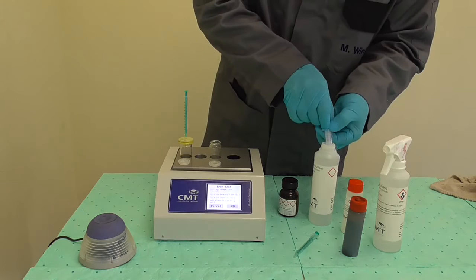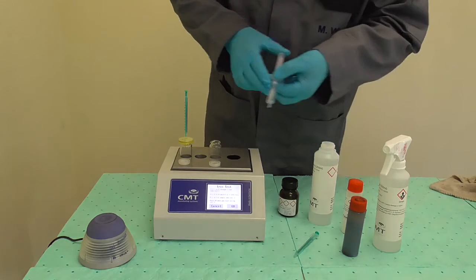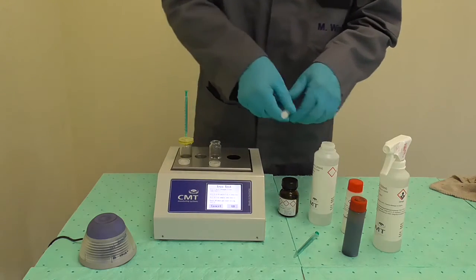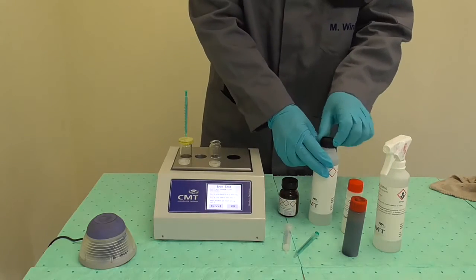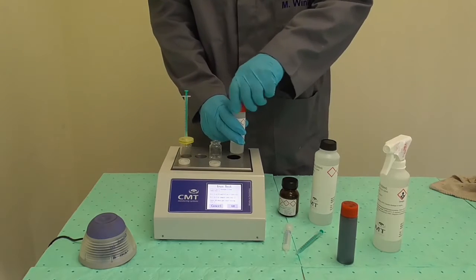Using a five milliliter syringe, extract exactly five milliliters from the bottle of reagent N. Take care to be accurate and close the bottle after extraction. Fill the extracted five milliliter reagent N into the second vial — the vial without the filter on top.